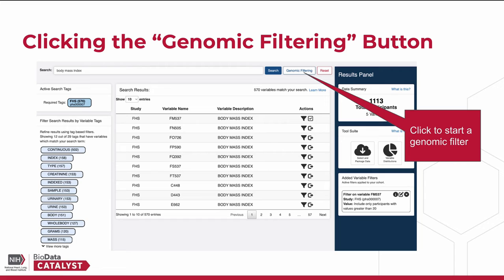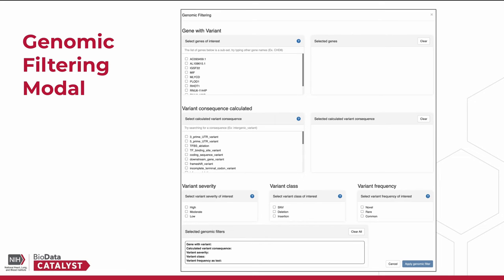To start a genomic filter, we can click the Genomic Filtering button next to the search bar. When this button is clicked, the screen will display the genomic filtering modal as shown here. Please note that to apply a genomic filter, you must select at least one gene with variant.